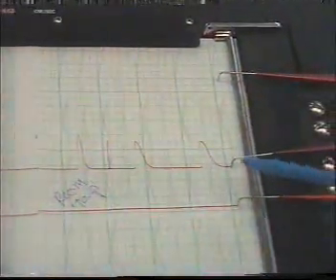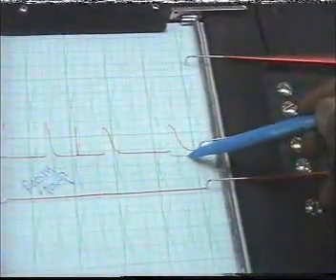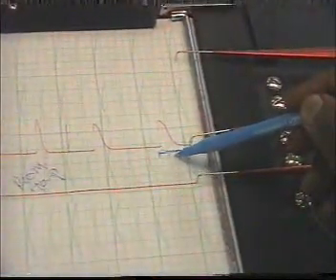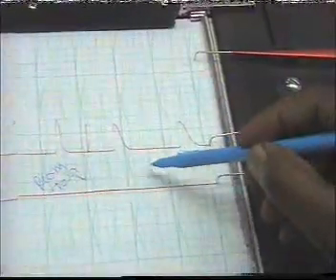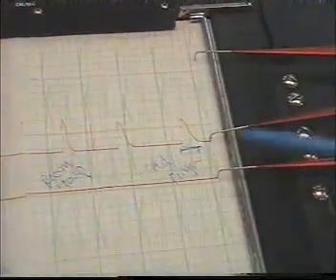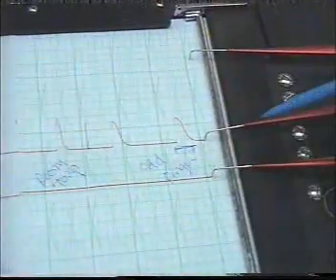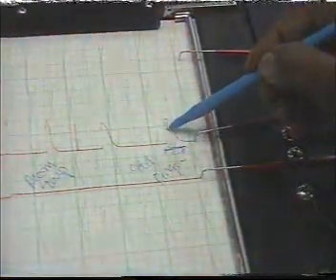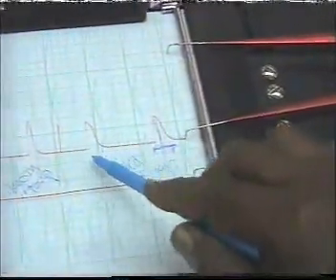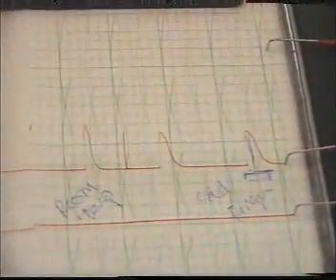الملاحظ هنا بدأ الامبليتيود اوف كونتراكشن يقل، والكونتراكشن سايكل أو الفترة بتاعة الانقباض والانبساط أخذت زمن أطول هنا مقارنة بالروم تمبريتشر. لما ضفنا الرينجر وهو في درجة حرارة منخفضة لاحظنا أن الارتفاع أو الامبليتيود اوف كونتراكشن decreased and the contraction cycle also prolonged compared to at room temperature.